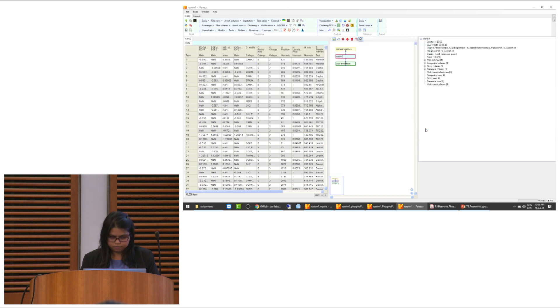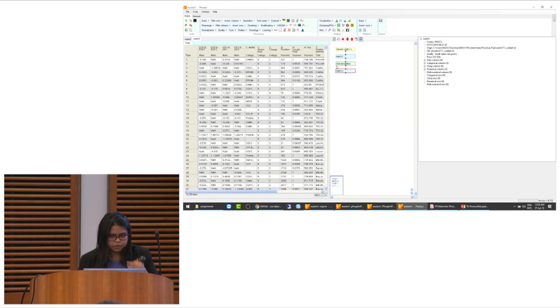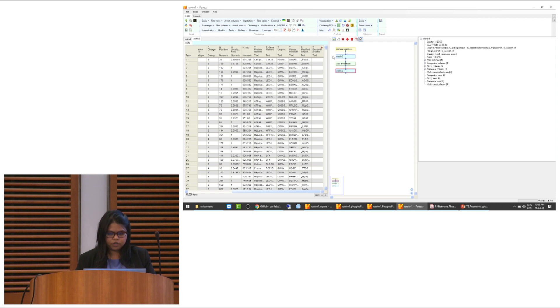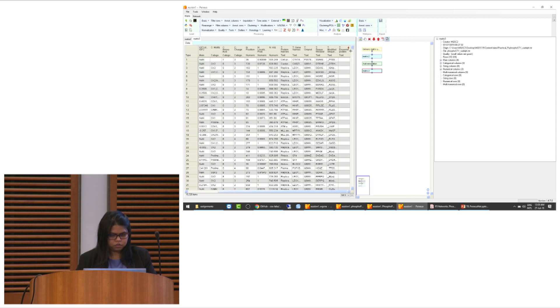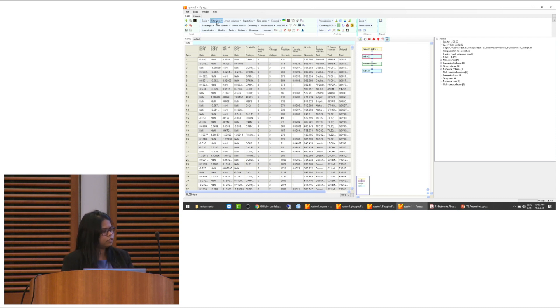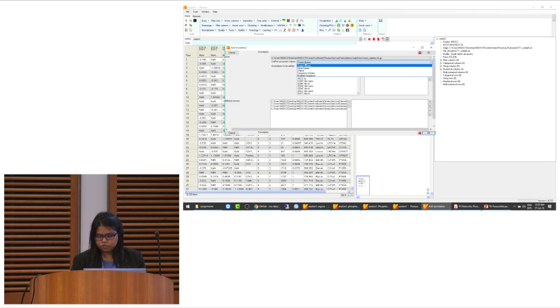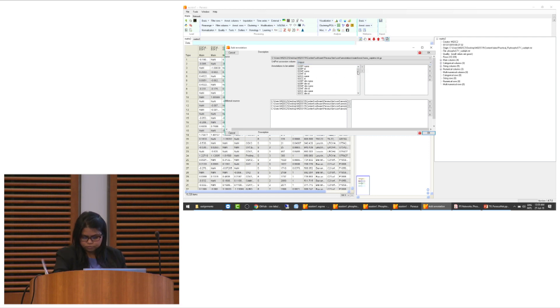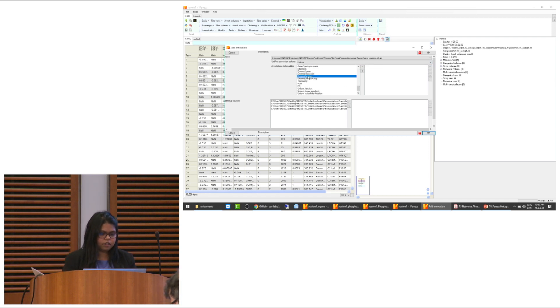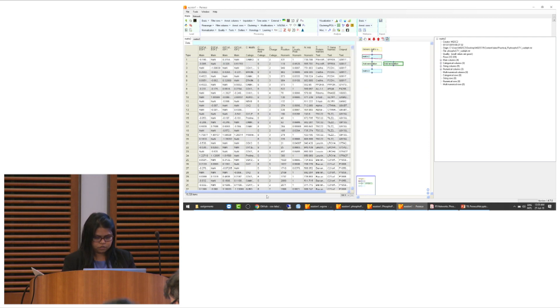Let's start and load the dataset for this tutorial. Go to your USB stick, then Data, then Practical 5. First, let's upload the Phospho STY dataset — this is a SILAC dataset with MCF cells measured in duplicates. Everything is selected automatically, so let's click OK.